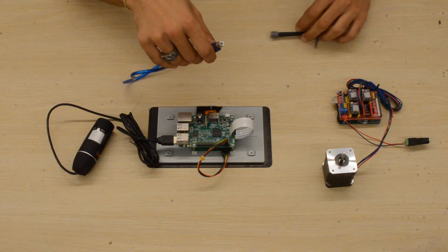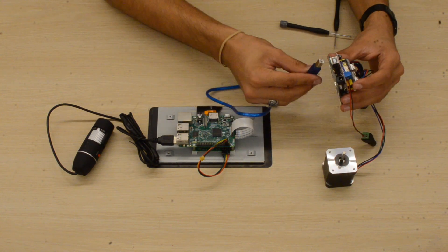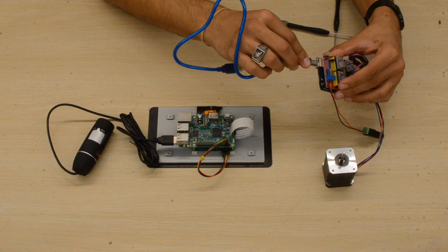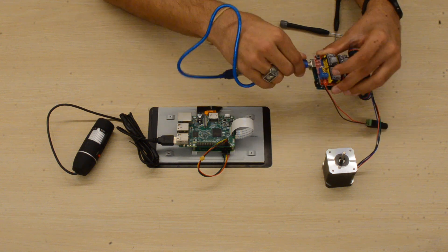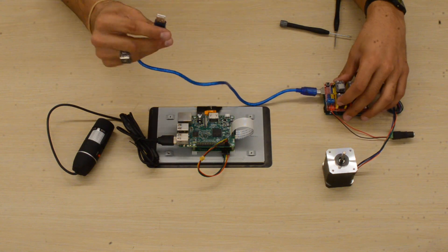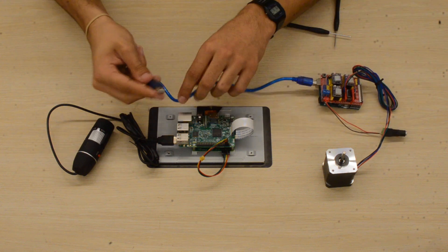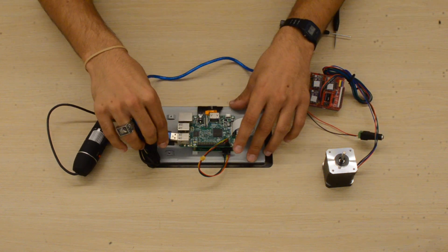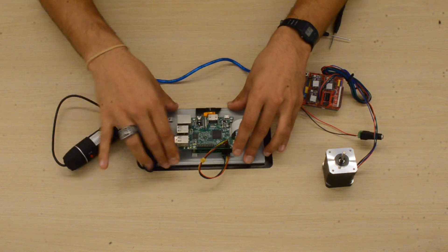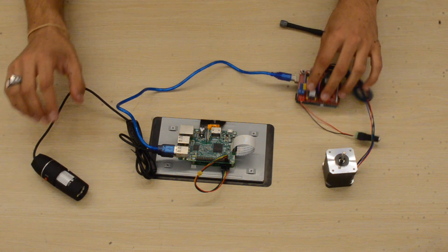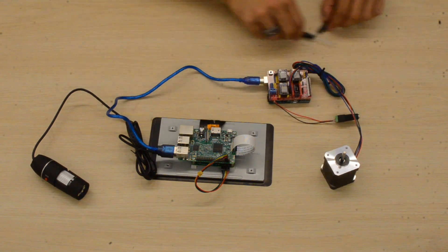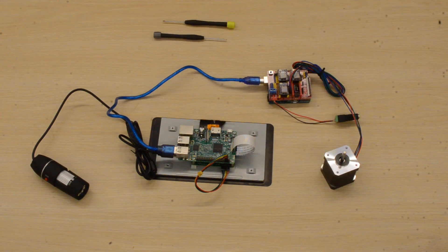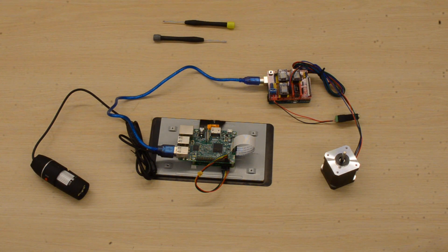Then we'll take our Arduino connection cable, connect it to the Arduino, and then connect it to the Raspberry Pi. And you're done.